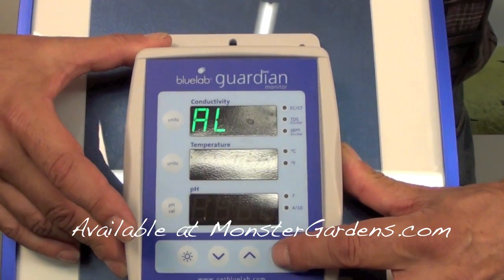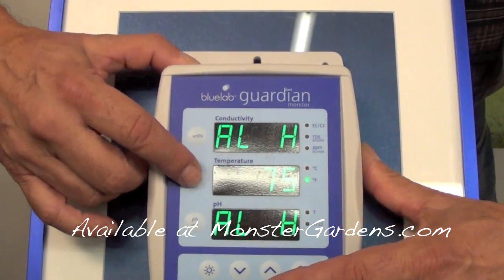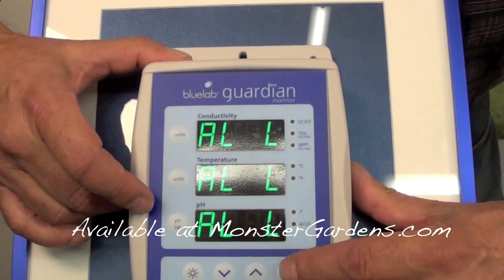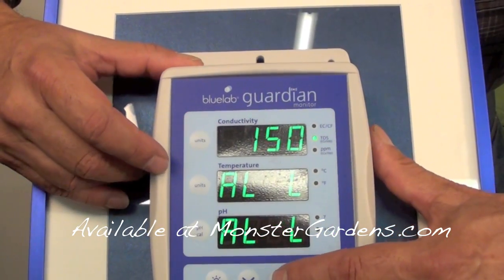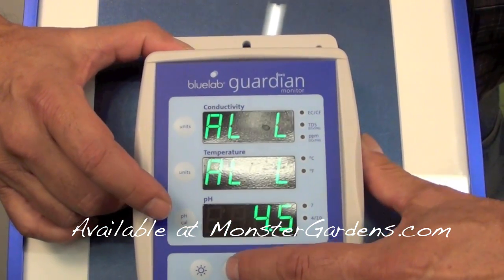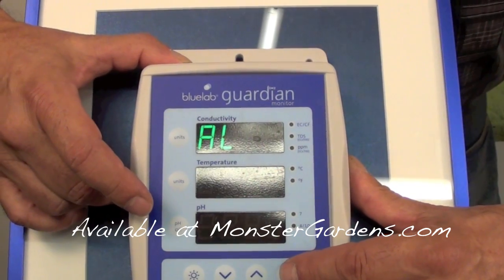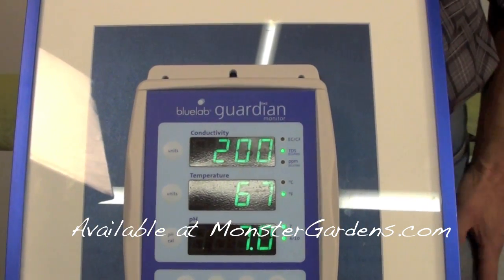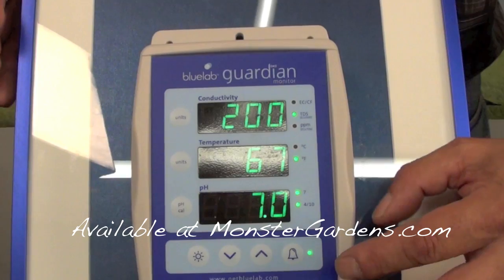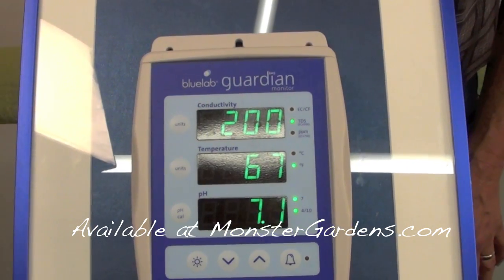So it'll actually tell you when it's moved out of the ranges you've set. There are the highs — you push the button and manipulate the highs and lows for temperature and pH level. Push the button again and you get your lows. You're just putting in the high and low of what you want for your solution. Push save, then push the alarm button. Anything out of your preset parameters will blink and let you know you need to act on your solution. You can also turn the alarm off — simple as that — and return to regular function.